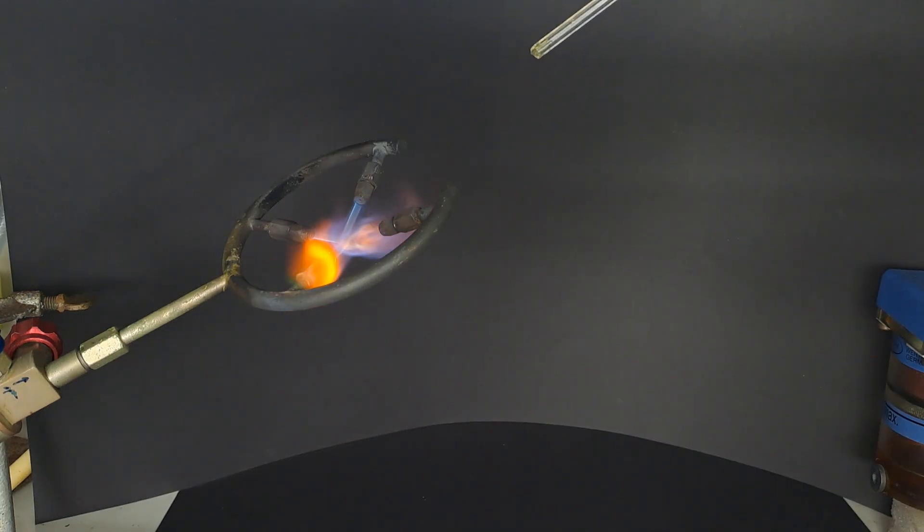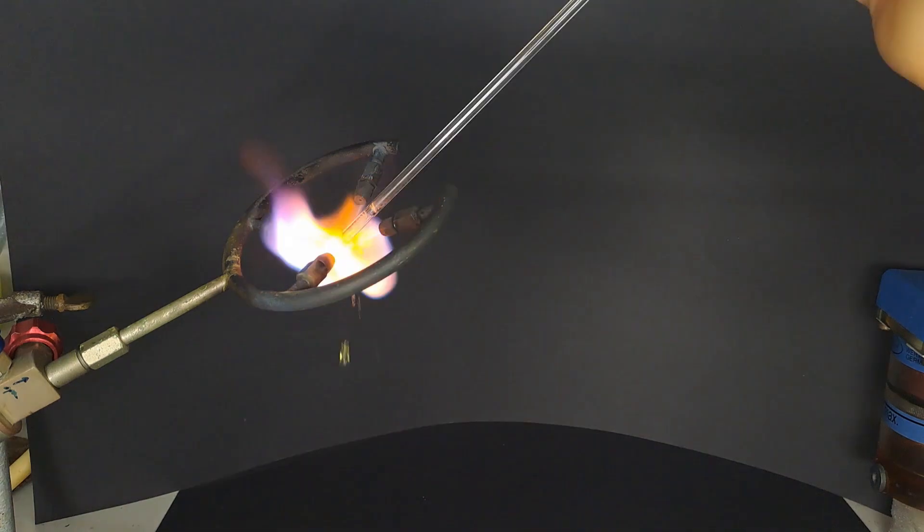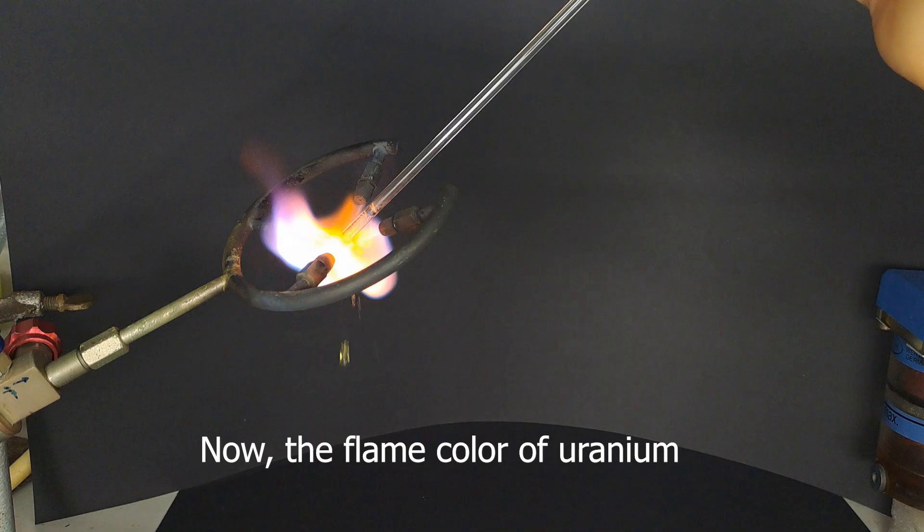What I have here is a quartz glass tube into which I carefully pipetted a drop of the uranium solution and it's blue! So the green color was probably from the metal of the needle, but now we know that the flame color of uranium is blue.